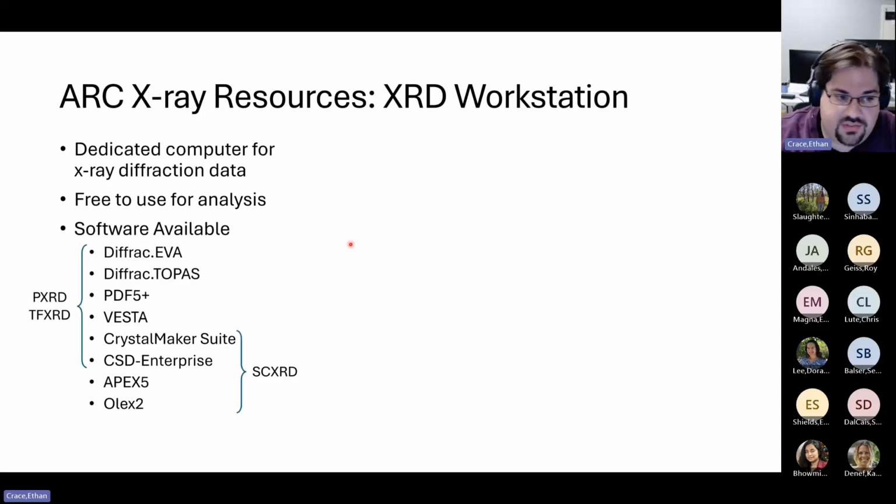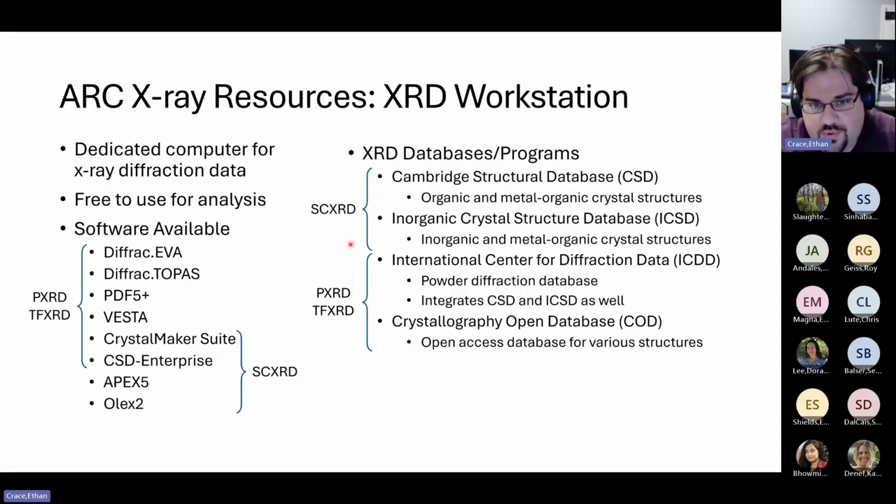I've loaded a bunch of software onto that system. It has all of the software that's used by the instruments to collect data and analyze data. There are also additionally some extra programs to help you work up your data, to visualize it, to make figures if you like. And we've also incorporated onto that instrument a variety of databases that you can compare your data against.